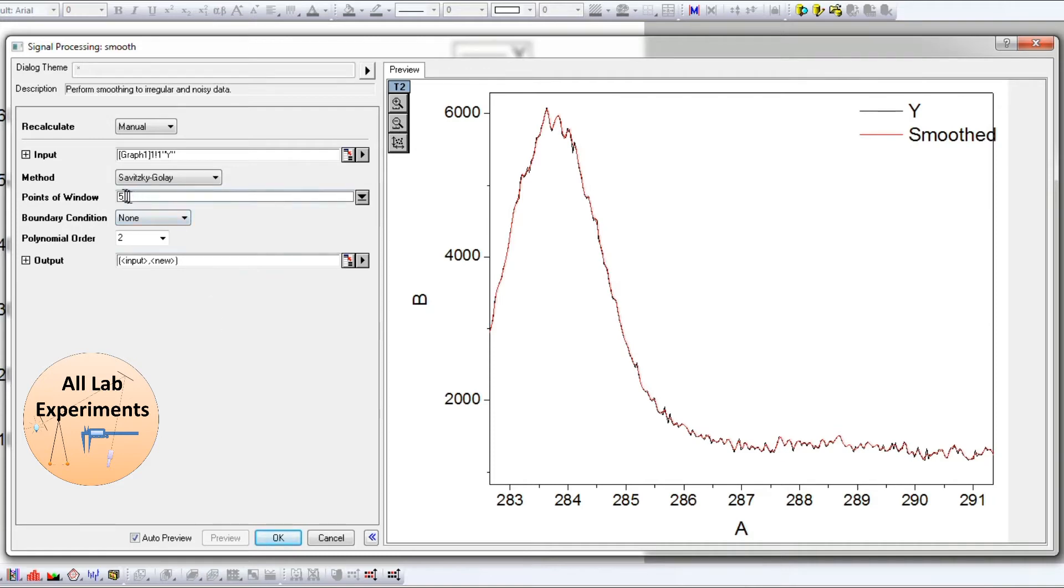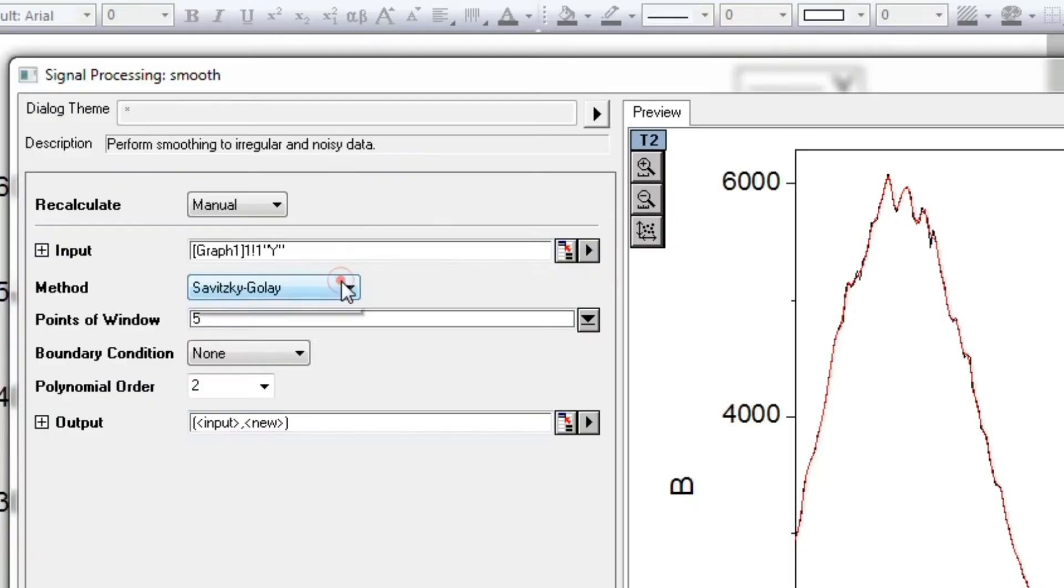Smoothing is just a five to ten second job. If I just adjust this number and press OK, I will get a smooth curve, but we should know up to what extent we can smooth a curve.